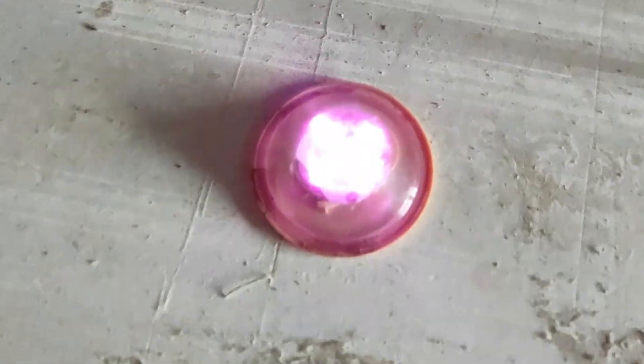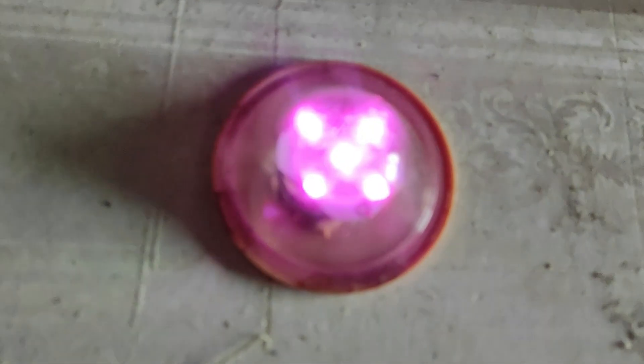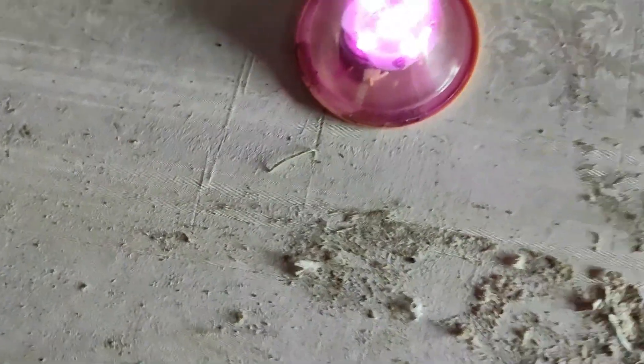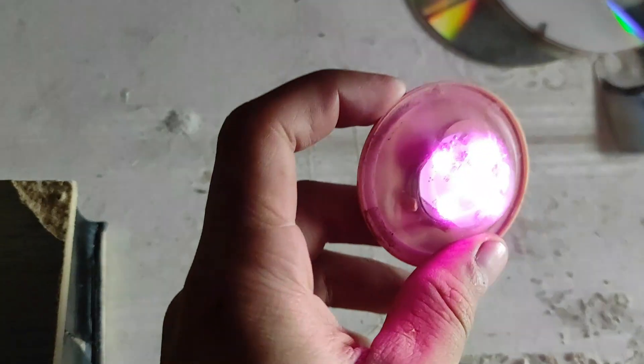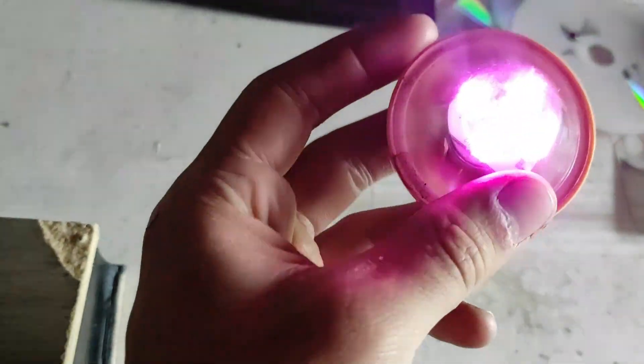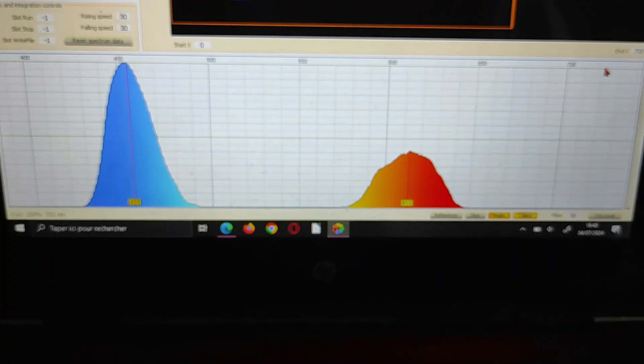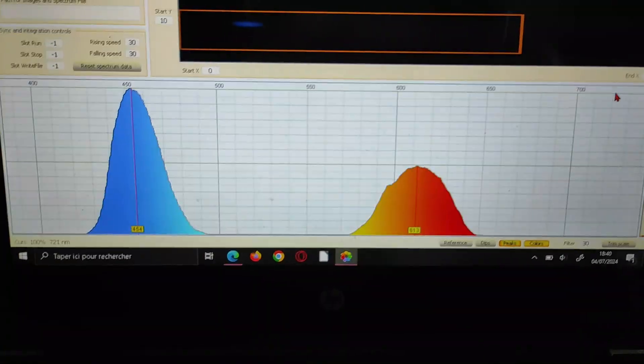The next thing is this pinkish LED lamp. The reason you would want to analyze it is because I personally know only a few colors of LED that are possible to make, and pink is not one of them. So how is the light produced? A quick look at the spectrum easily shows us that it's made from two different LED sources, one blue and one orange-y red.